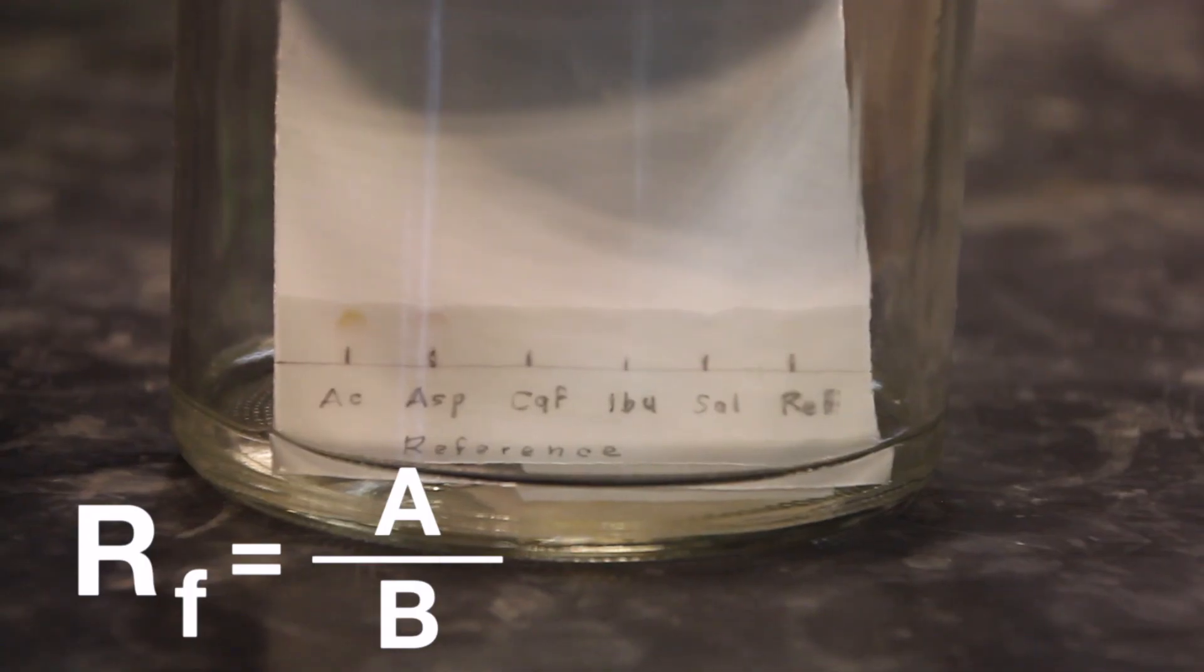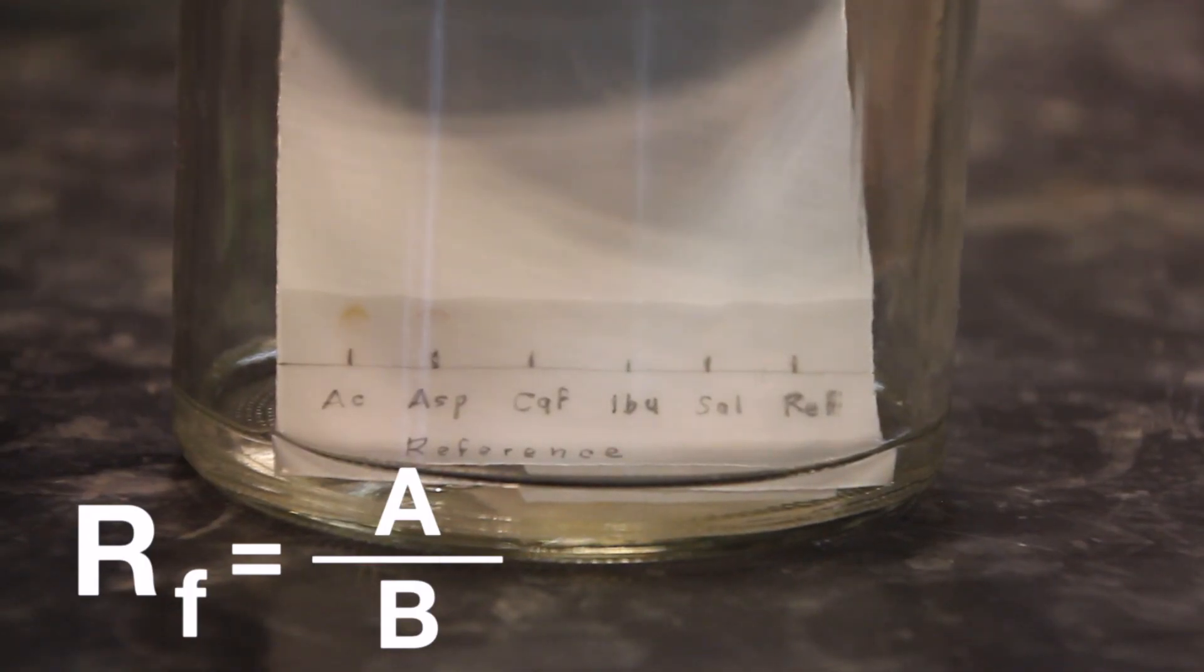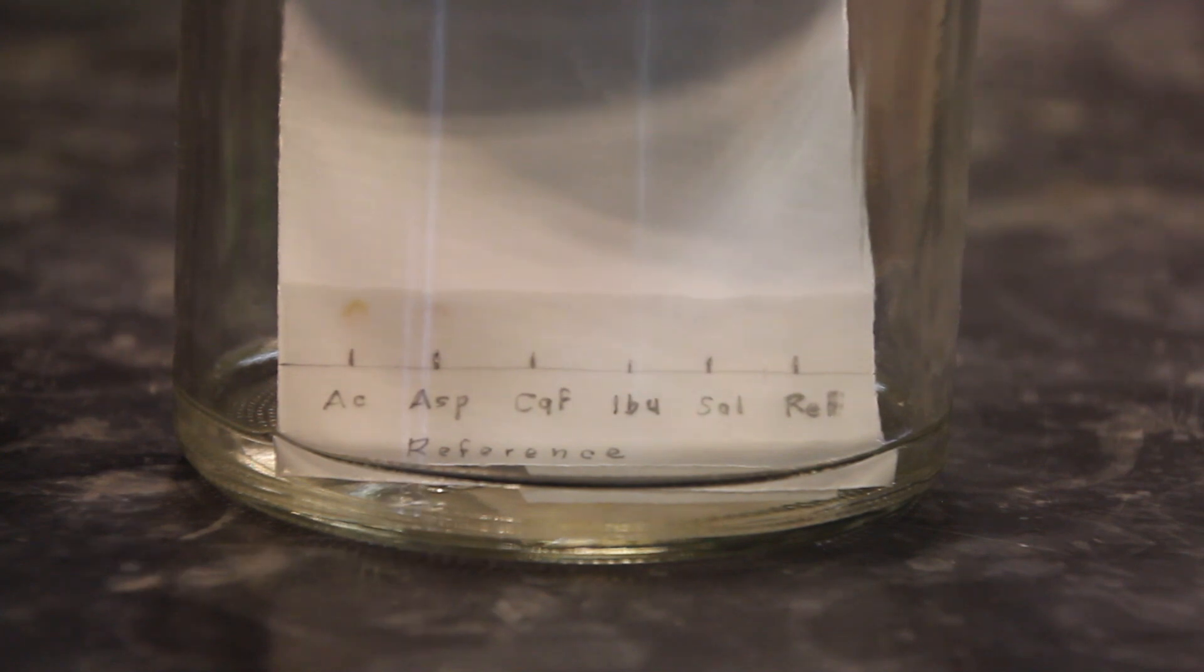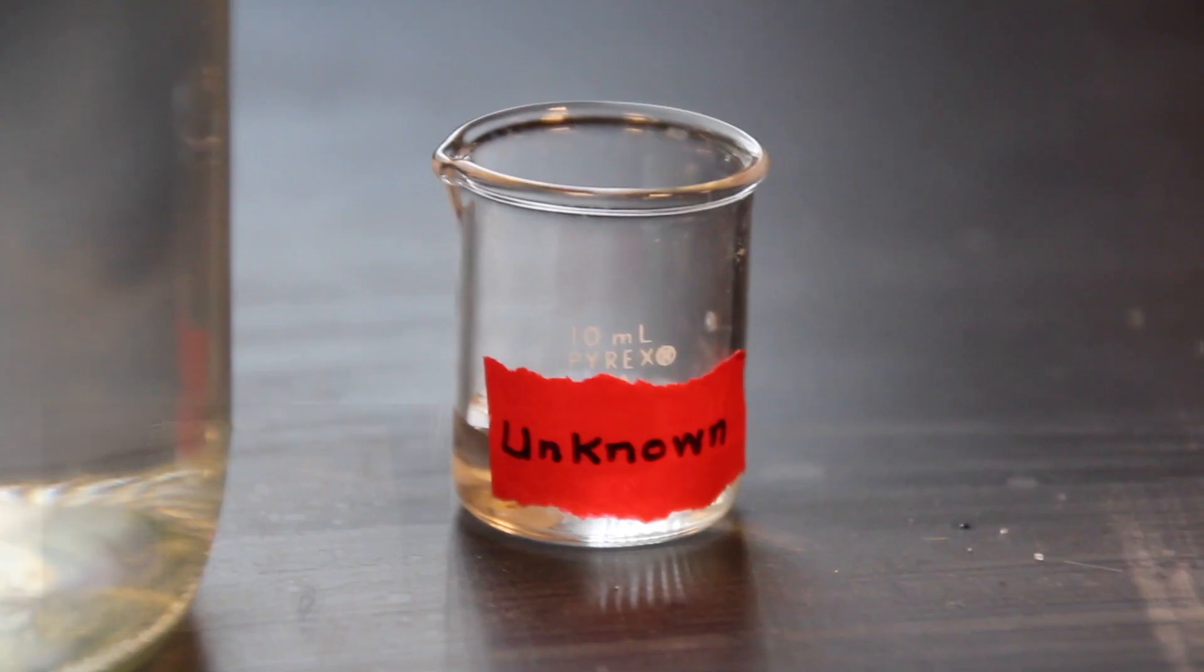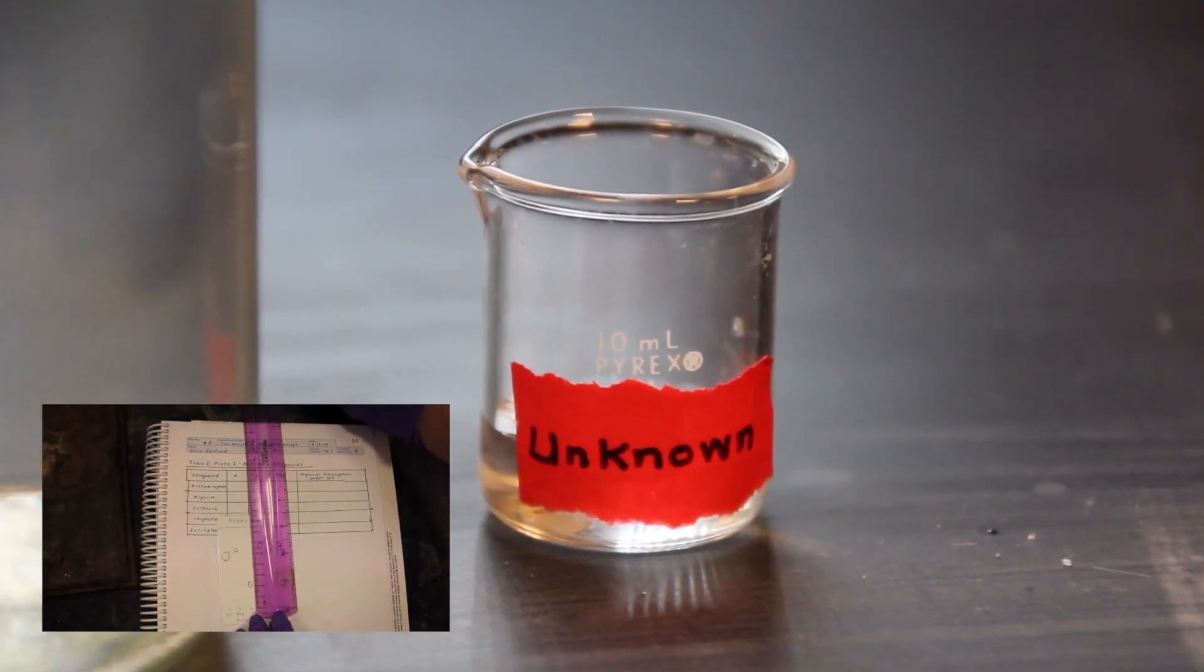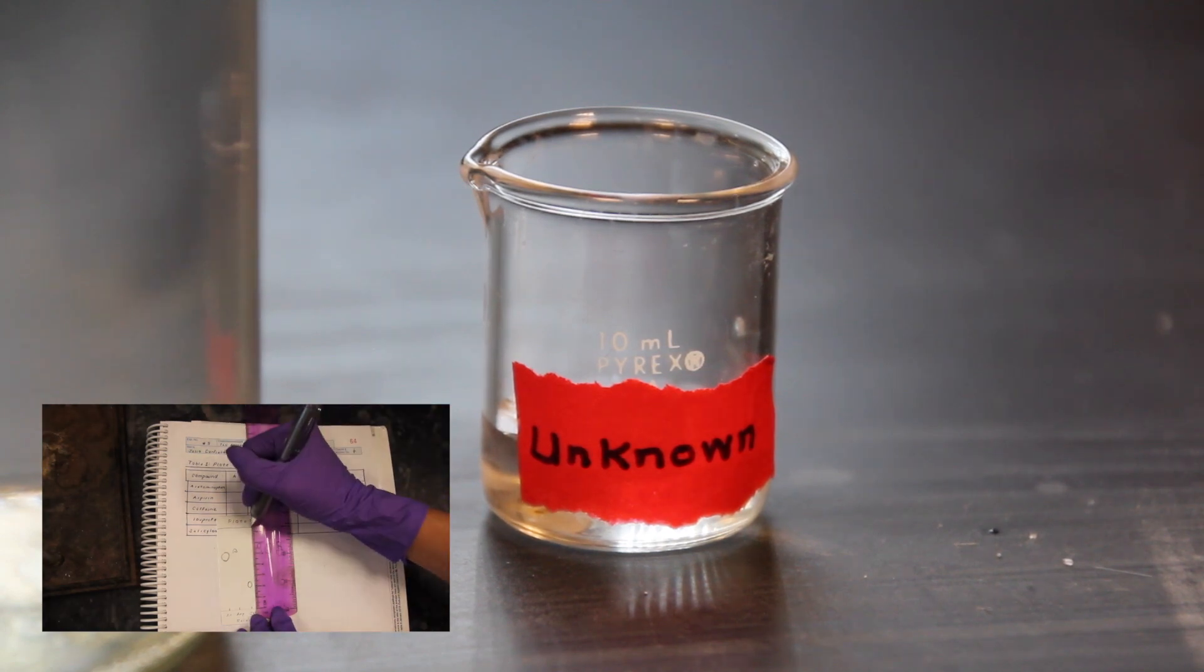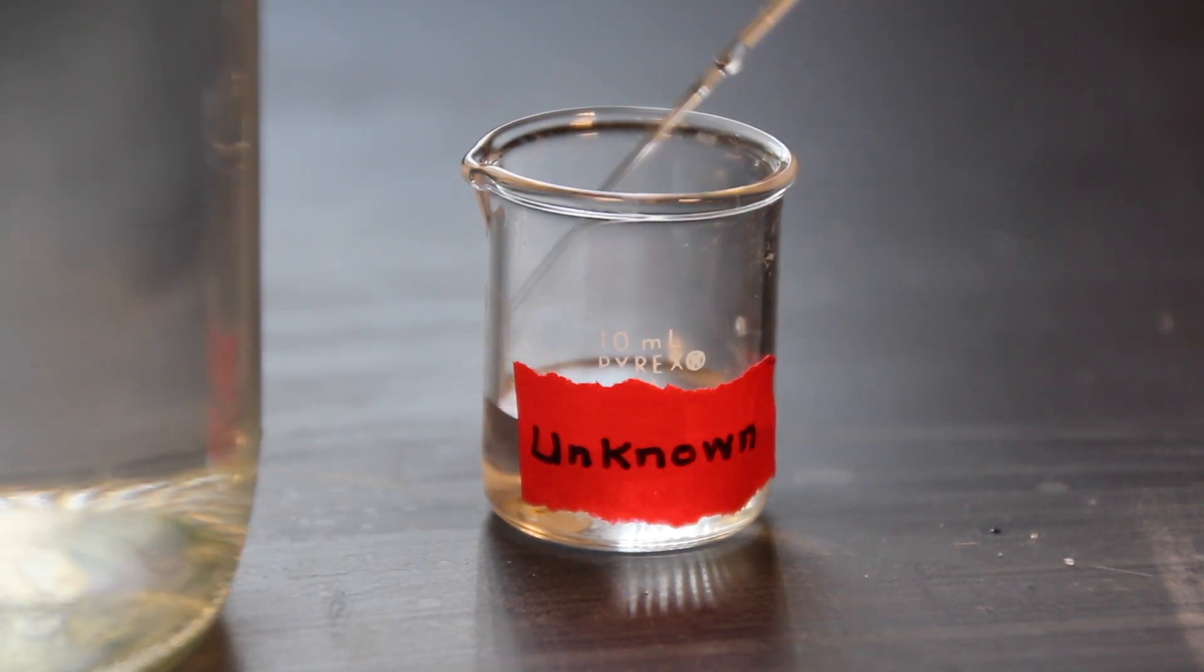You will first need to chromatograph each of these compounds separately to determine their RF values under the chosen chromatographic conditions, and then analyze an unknown analgesic tablet and report its contents via correlation to the known RF values of possible constituents.